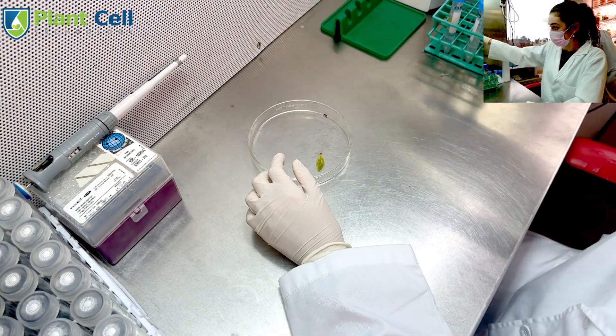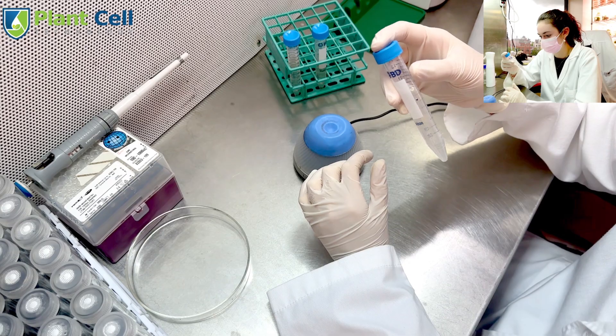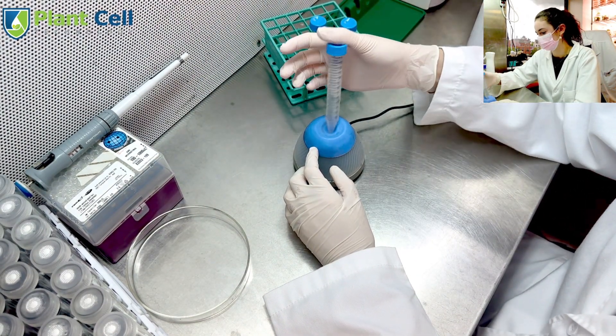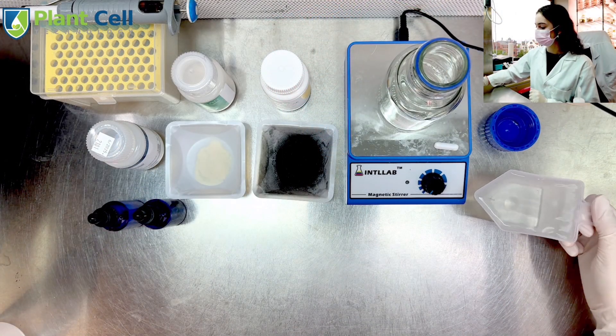I repeated this process for the remaining seed pod pieces and mixed each using the vortex. I noticed that the seeds finally started separating, so it is time to transfer them to media, which is very easy to make.